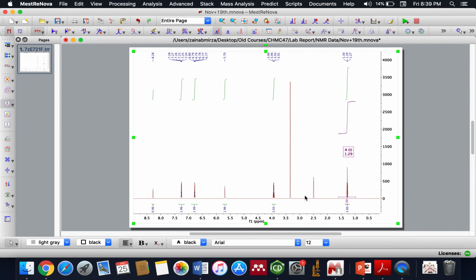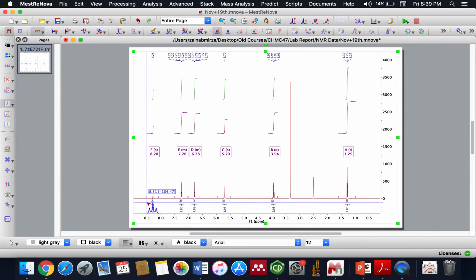So I would just zoom out and literally, I'm going to press the J key and do the multiplet analysis blindly on all of them. Here you don't have to worry about the number that's showing because we're going to delete that anyway. And now you see how ugly it looks. It looks very crowded, very messy, and you're automatically going to lose some marks if you submit it like this, right?